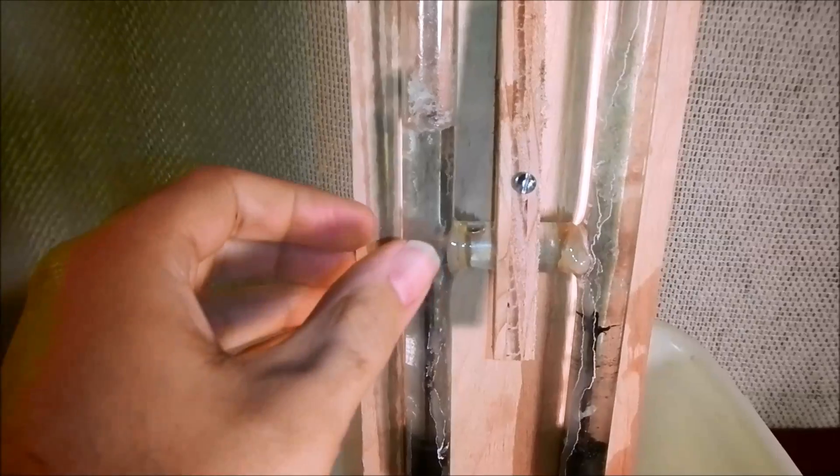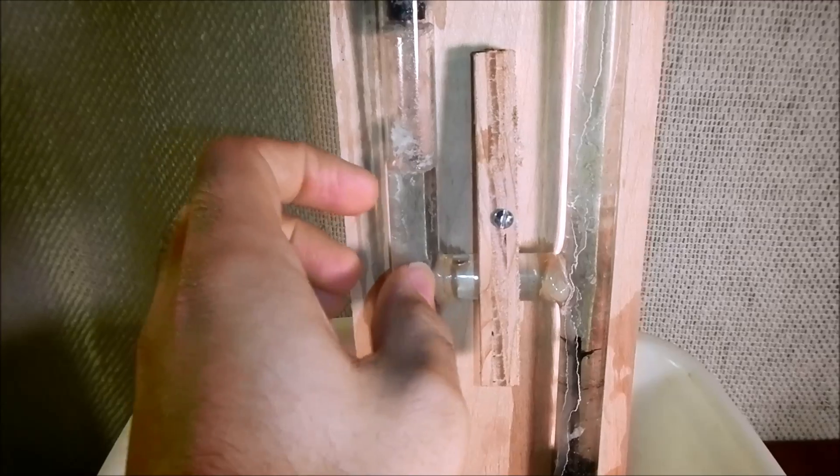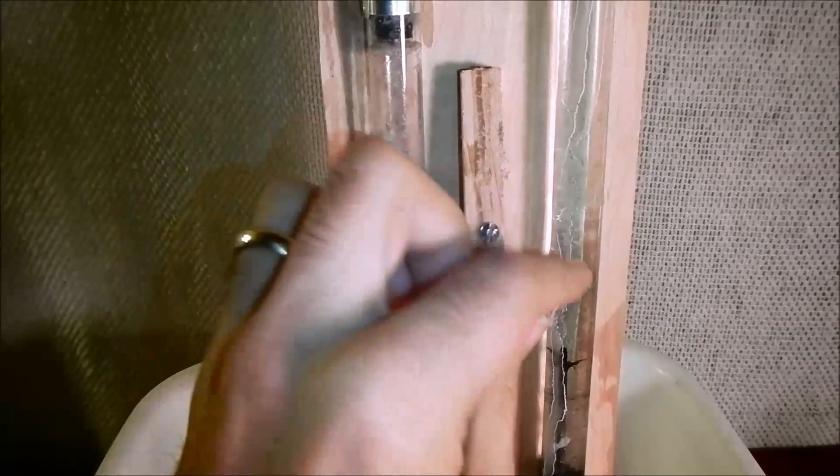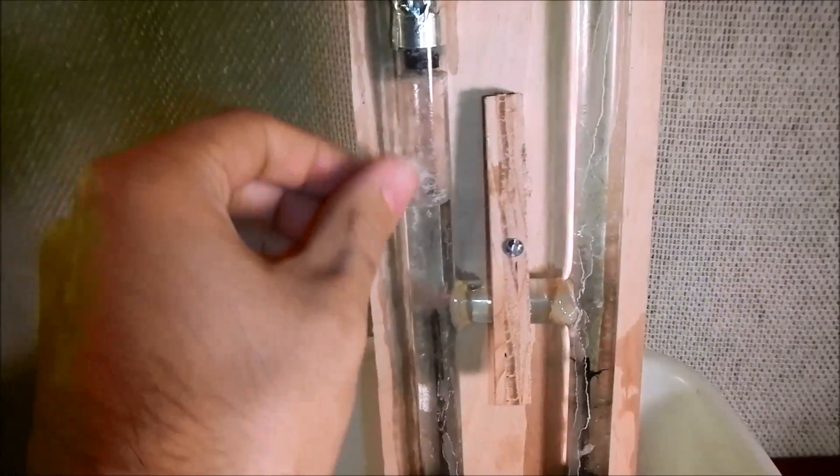I used a blowtorch to blow a hole in the sides of the rods, and then I cut a piece of tubing and I epoxied it here and here to form my H.